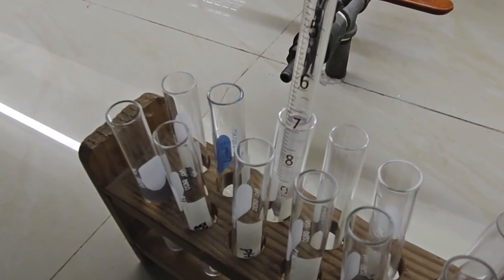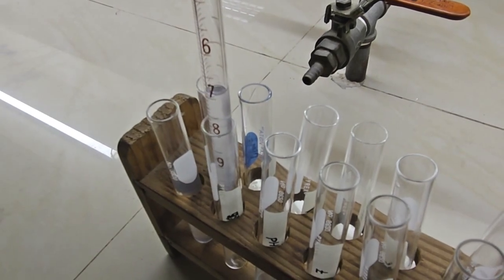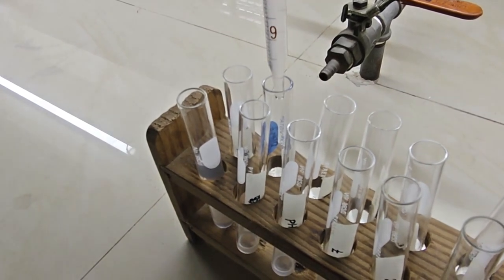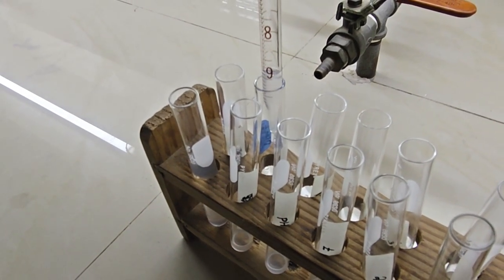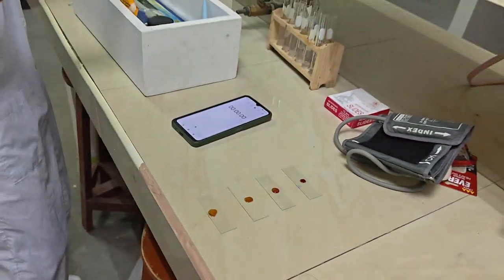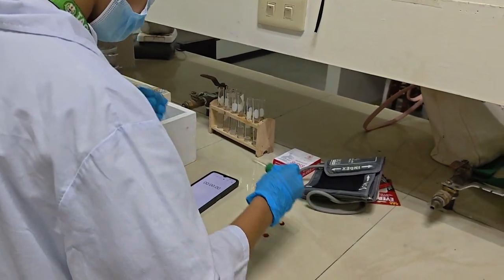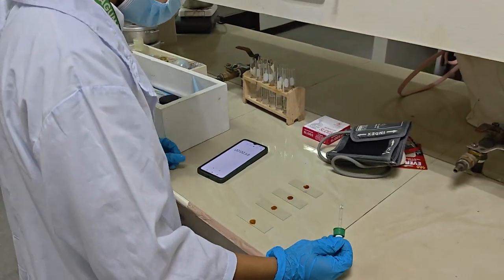For the third experiment, we studied the effect of substrate concentration on enzyme activity. 4 test tubes were prepared with different starch concentrations, which are 0.5%, 1%, 2%, and 3%. Equal amounts of saliva were added to each tube, and all tubes were maintained at 37 degrees Celsius. The stopwatch was started immediately after mixing. Every 30 seconds, drops from each tube were tested with iodine to monitor starch digestion. The time needed for the disappearance of the blue-black color was recorded.